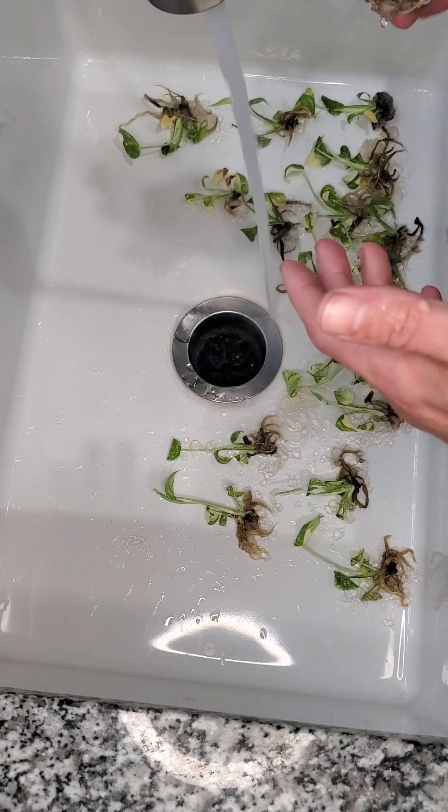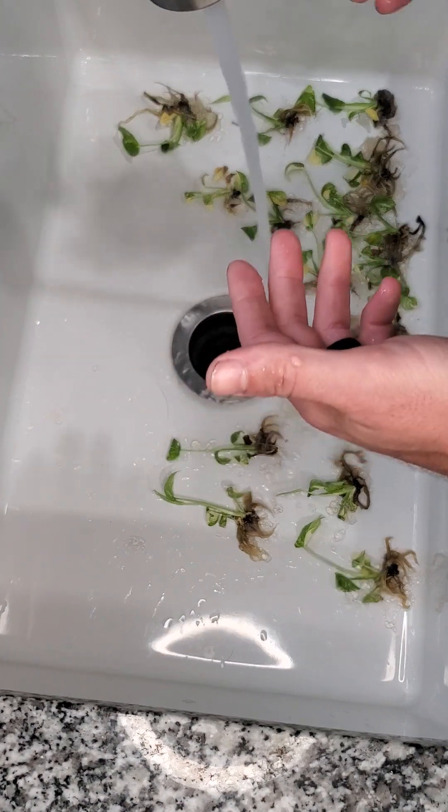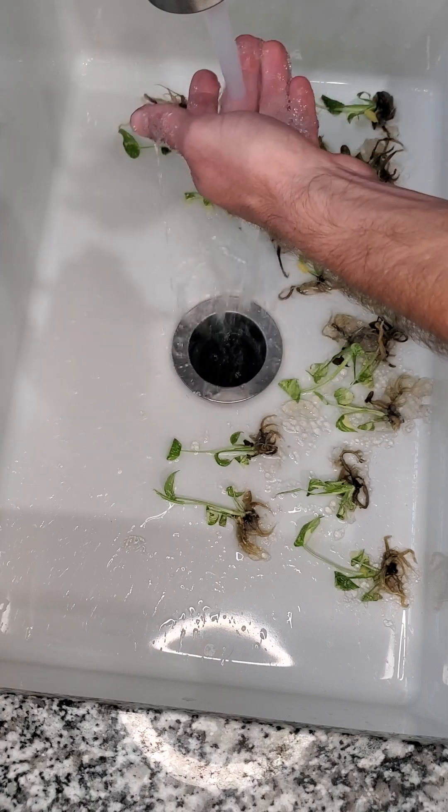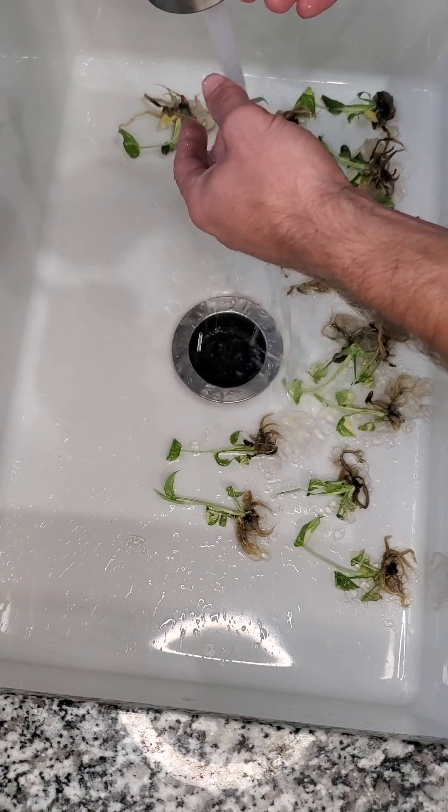So I go with not quite room temperature but not hot water — a temperature that you're able to keep your hands under for an extended period of time. You do want it to be a little warm; it helps to get the gel off.